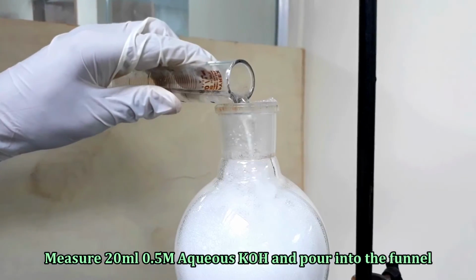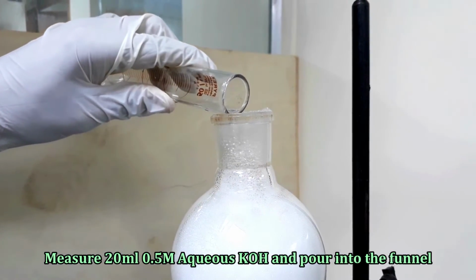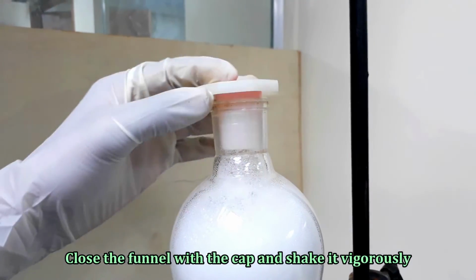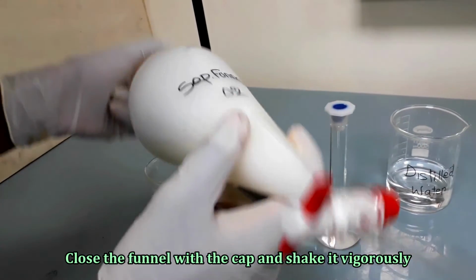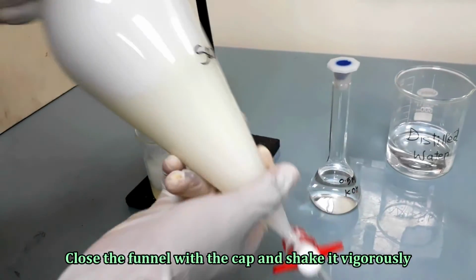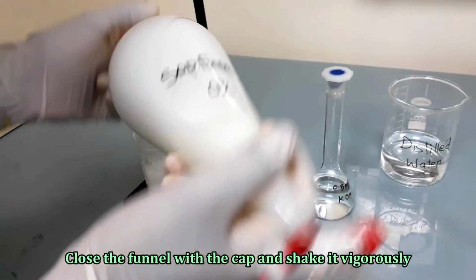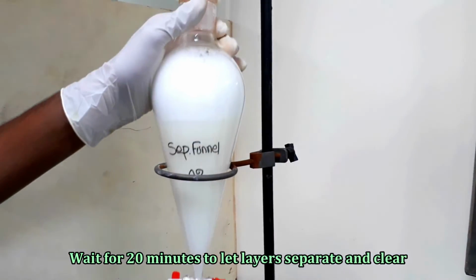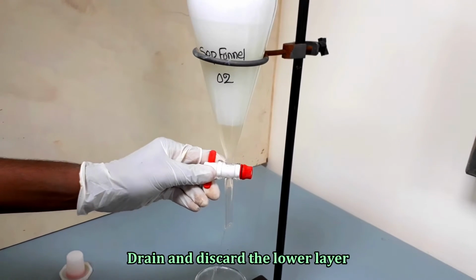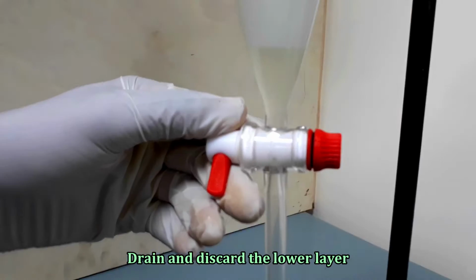Add 20 ml of 0.5 molar aqueous potassium hydroxide solution. Close the funnel with the cap and shake it vigorously. Wait for 20 minutes to let layers separate and clear. Drain and discard the lower aqueous layer.